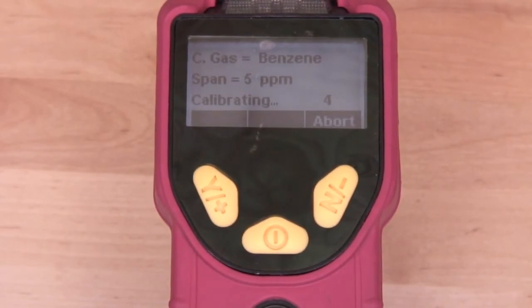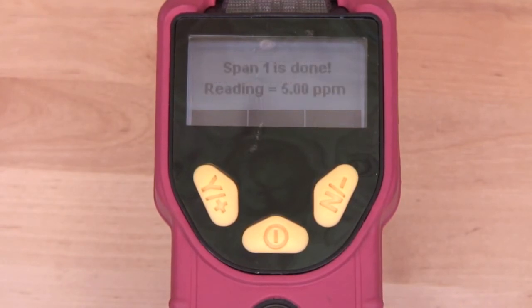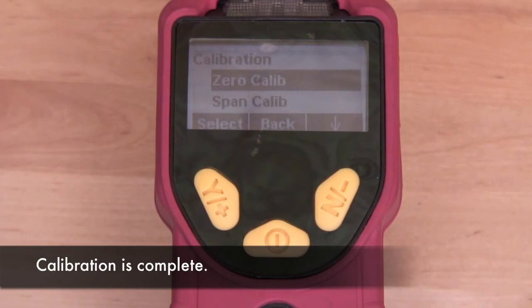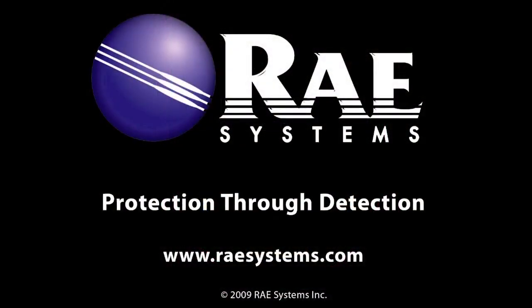After 60 seconds, our calibration is complete.